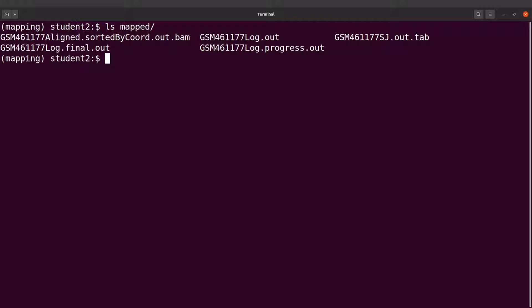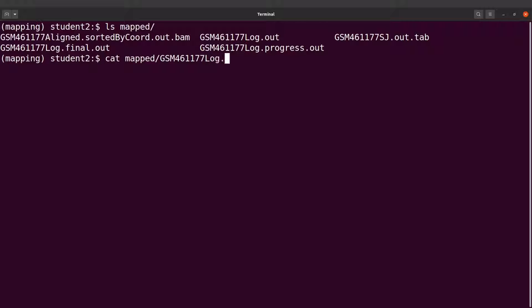I'll start with the mapping statistics log file. It's a text file so I can use the cat command to display the content. I can say cat mapped and then I give the file name, so let's run this command.